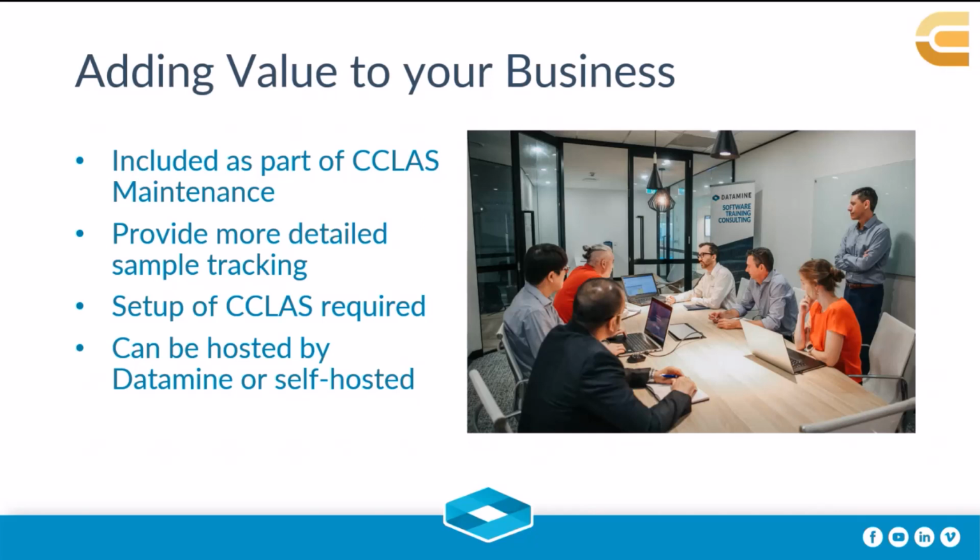And the other thing that is also required is you've got to host the web server to communicate with CCLAS. So Datamine can host that for you, or your IT team can host that themselves.